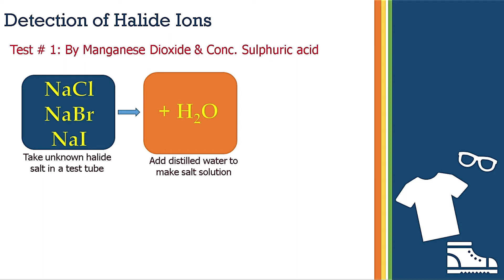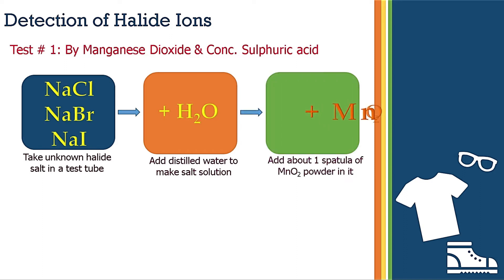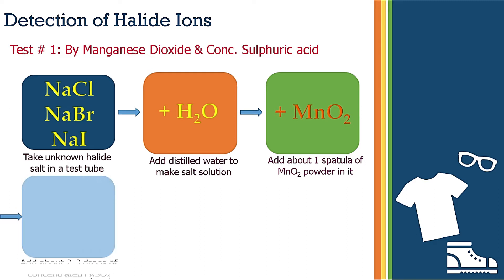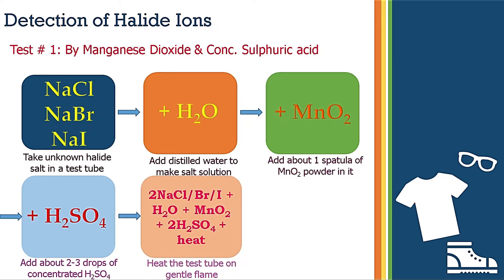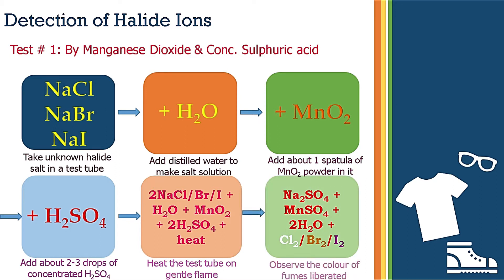Take the unknown salt in a test tube and add distilled water to make a salt solution. Then add about one spatula of manganese dioxide powder — this is a black colored powder. Then add two to three drops of concentrated sulfuric acid into this mixture. Finally, heat this mixture. The salt, water, manganese dioxide, and sulfuric acid will combine together due to heat.